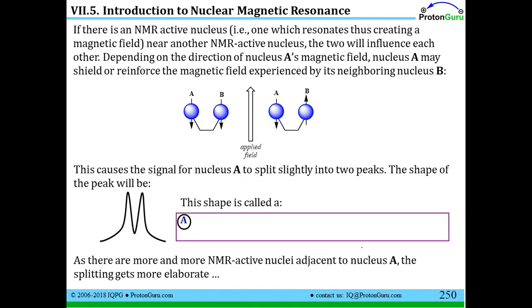Now, we talked about how the NMR technique works. We talked about the nucleus can be aligned with or against the applied external field. Then we talked about the fact that electrons near the nucleus would oppose the external magnetic field and therefore shield the nuclei. But if you have these nuclei in a molecule and their nuclear magnetic moments can be aligned with or against the applied field, they might start to influence one another if they're close to each other, right? Let's consider these two carbons. And these are protons on adjacent carbon atoms, and they're kind of close to each other, right?